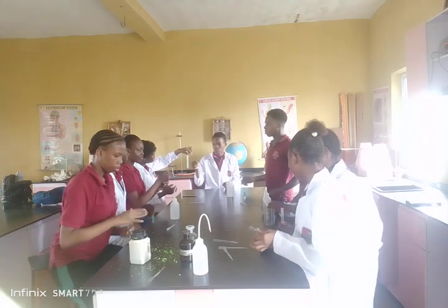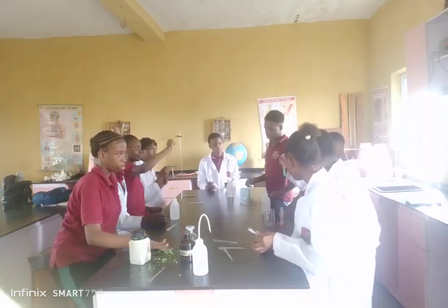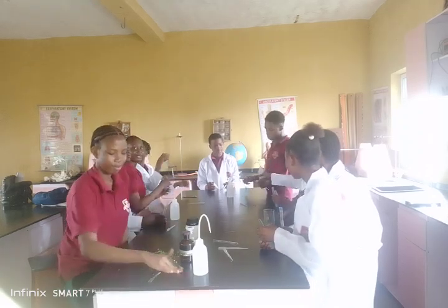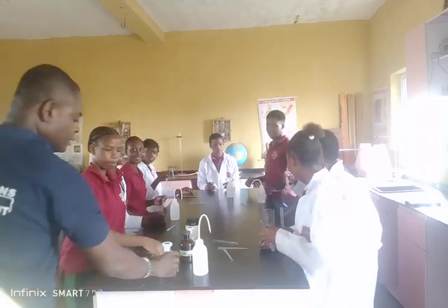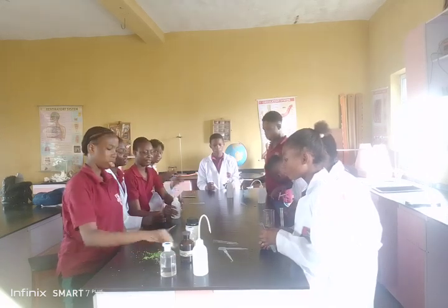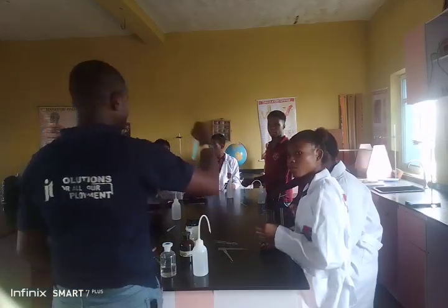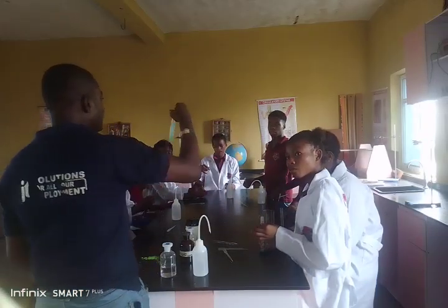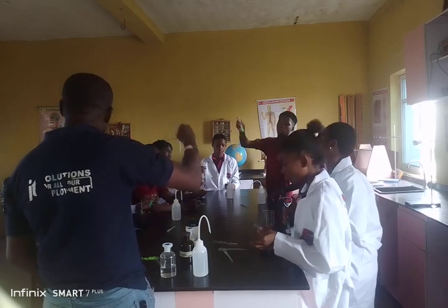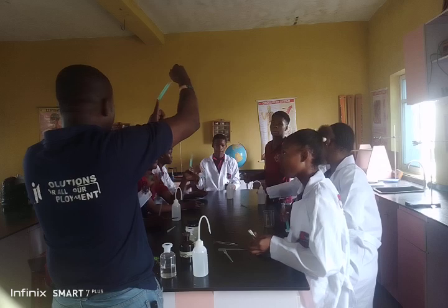You guys should remember, I'll do this again. Now, you have done that. Okay. Now, what's the next thing to do? The question says, put C into the test tube. We have done that. He said, add about 5 cm cube of distilled water. We have done that. He said, shake thoroughly. You have shaken, right? And you make sure there is no particle again.